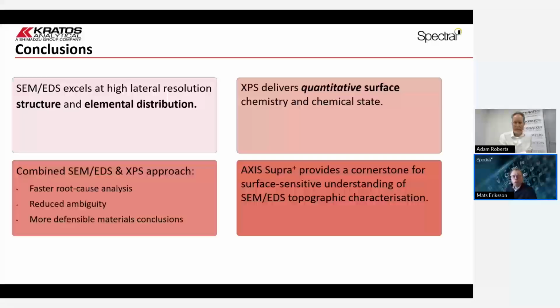And if you need to go to thicker materials, again, glow discharge is absolutely a technique. Maybe that is similar in surface sensitivity to SEM EDS, or even XRF, where we take X-rays going in and X-rays going out. That gives us the ability of looking at at least 50 microns or so in thickness. It struggles when we go below 10 nanometers for sure, but for thicker layers, of course.